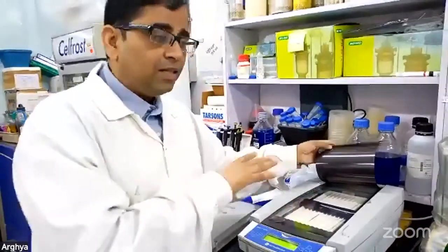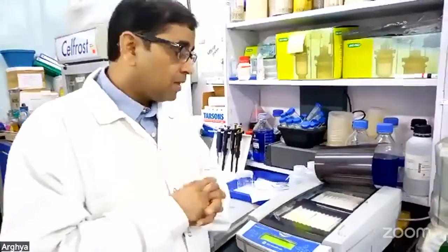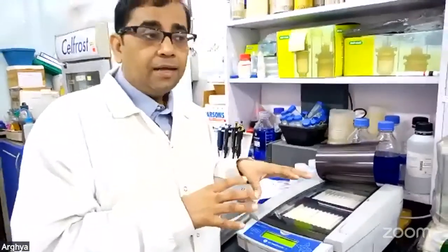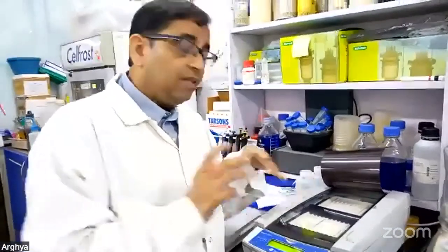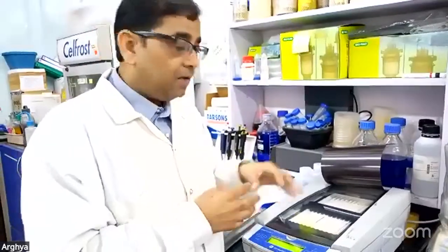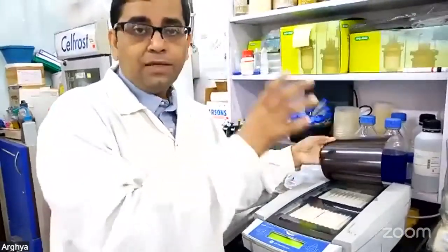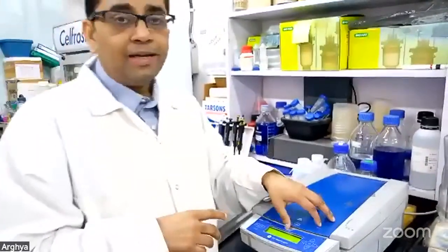But this is, I think, a field that, as you can see, is still valuable in our lab. These kinds of things have always been the gold standard for doing proteomics. Over time, people realized that running the gel is easy, but doing a reproducible gel of maybe 200 samples is not that easy. That's where there was a shift from 2D gels to the shotgun proteomics approach. But this instrument, the first approach, is looking at the isoelectric focusing separation.